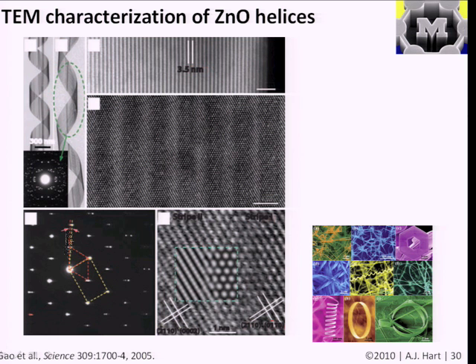And another thing you can do in the TEM is electron diffraction, or you can take a diffraction image that lets you compute the crystal structure based on the position of the diffraction spots or diffraction peaks. And we'll talk more about that later, but in the TEM you can typically switch it into a diffraction mode and you take a picture, but this picture removes certain apertures and optics from the column, so you're able to just impinge the beam onto your sample and therefore collect a diffraction pattern like so.